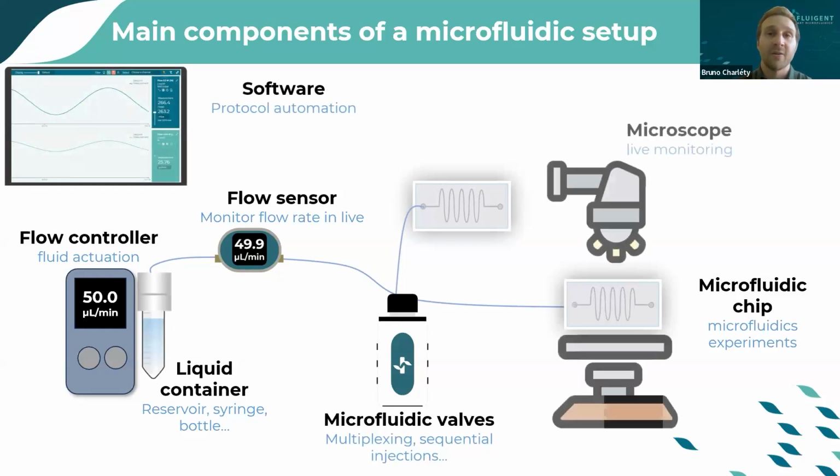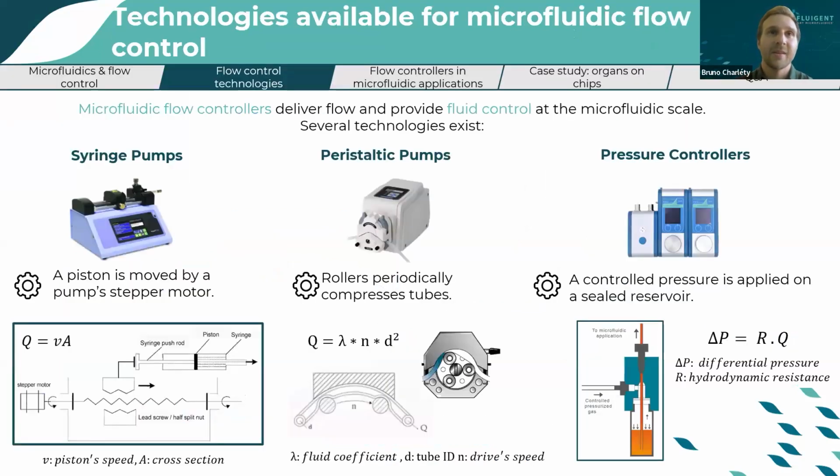So in this webinar, of course, we will focus on the flow controllers. There are many flow controllers available for microfluidics. We here focus on three main systems. Those are the main systems cited in the literature.